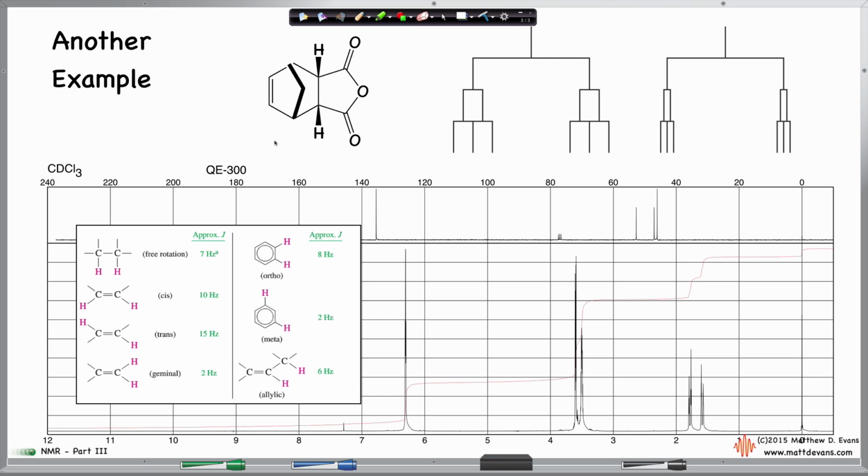But here's a molecule. I wanted to put this one up here because this is something we're going to synthesize this semester via Diels-Alder reaction. This molecule looks quite complex. It's a bicyclic compound, but the truth is it doesn't have too many hydrogens. There's a couple more hydrogens here at the bridgehead position, and then there's a hydrogen here and a hydrogen here. And, of course, the double bond has hydrogens.